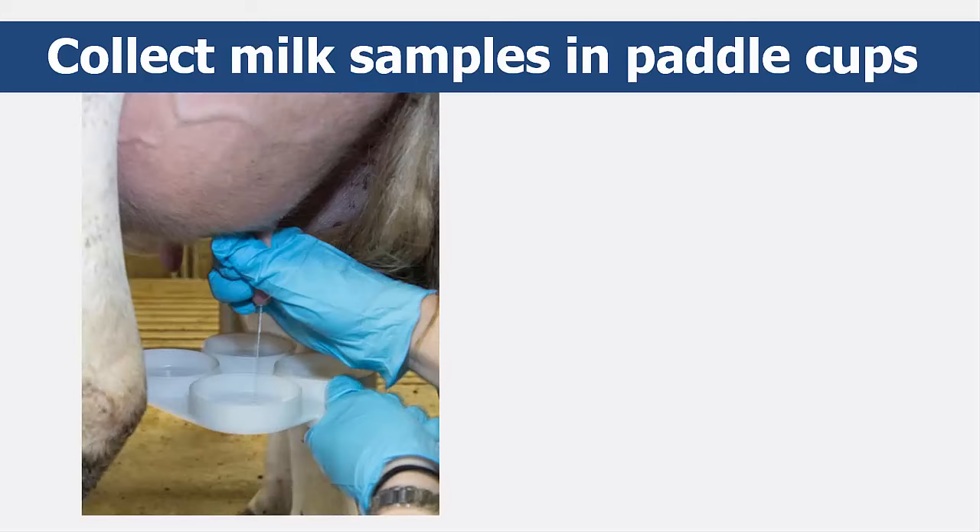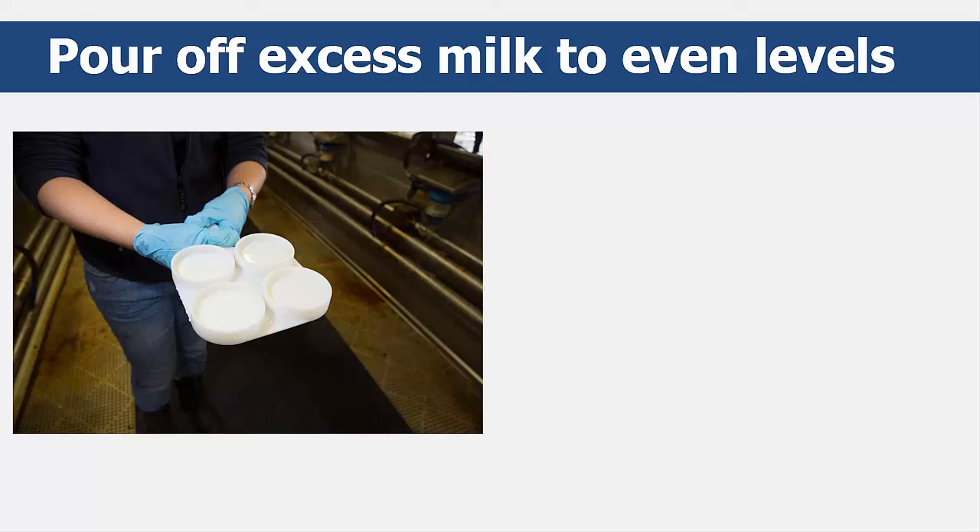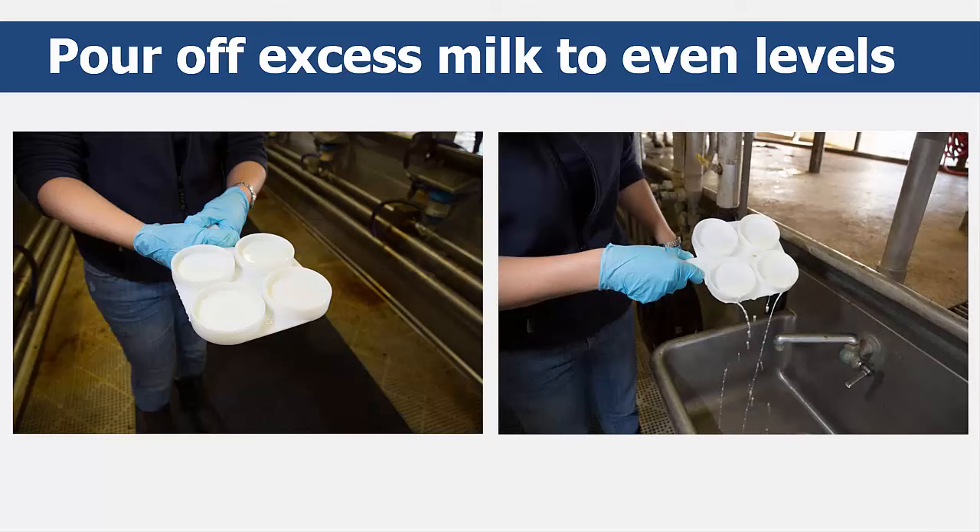Stand behind the cow and orient the CMT paddle between the cow's rear legs under her udder. Squirt three to five streams of milk from the left front teat into the left front paddle cup, then repeat with the right front teat into the right front cup, the left rear teat into the left rear cup, and finally the right rear teat into the right rear cup. Once each paddle cup contains one milk sample, tilt the paddle slightly to the side and let the milk run evenly until the milk levels are even with the circles in the bottom of each cup.